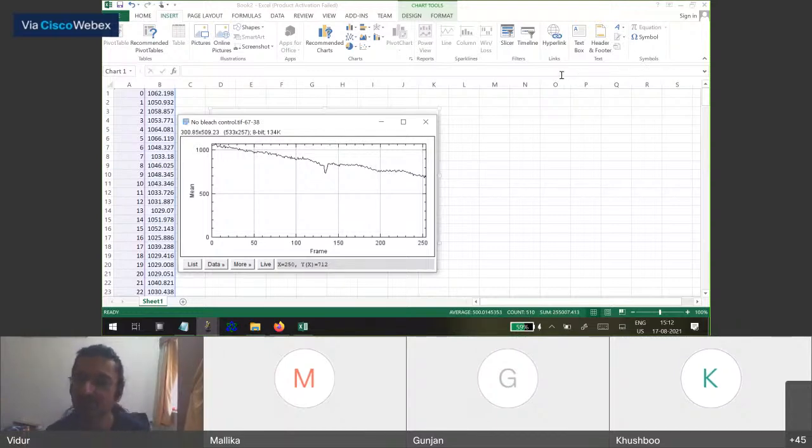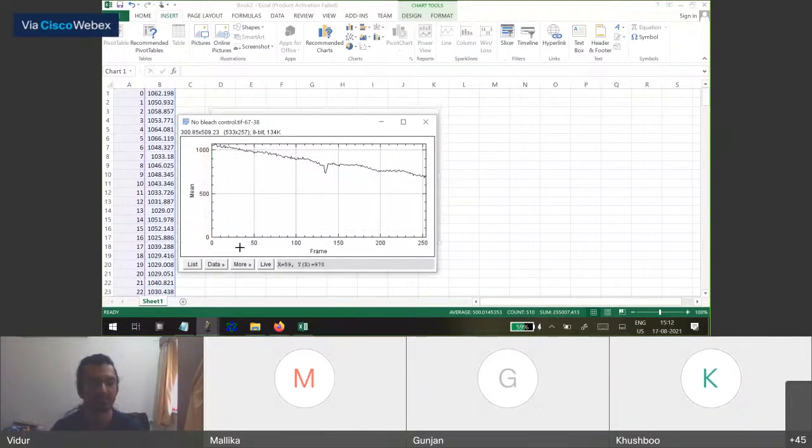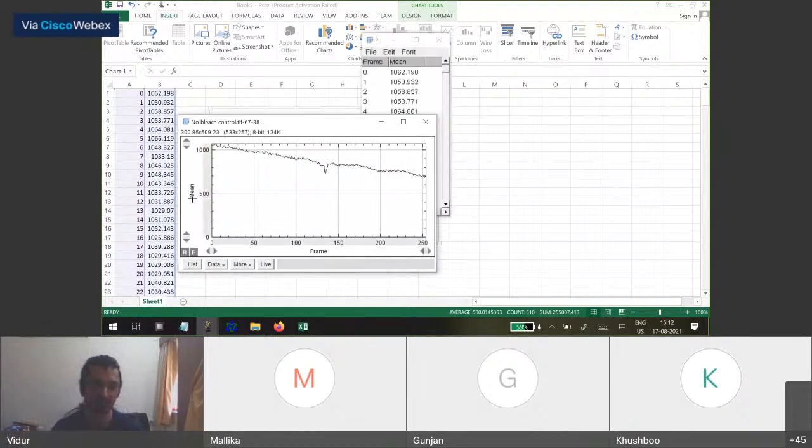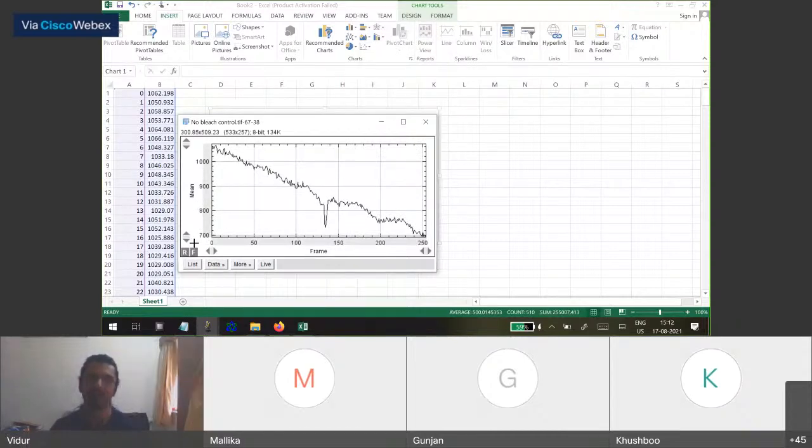I didn't quite understand this question. Oh, you mean why are we rescaling this from 0 to 1000? Because if it was not scaled, generally how it starts out is like this, from 1000 to 700. Just looking at this graph, since the value is 1000, it may be easier to see that you just divide it by 10 and that's your acquisition bleaching. However, you can have random numbers like 3556 or 4356, and you can have some other random number here. So it may not always be the best idea to leave this as auto scaling.